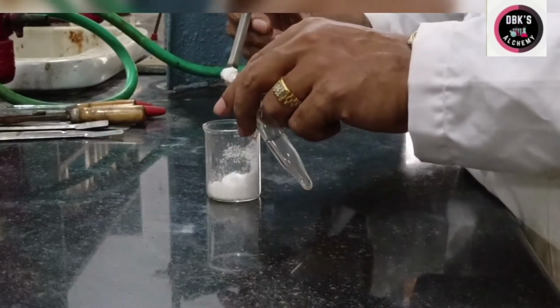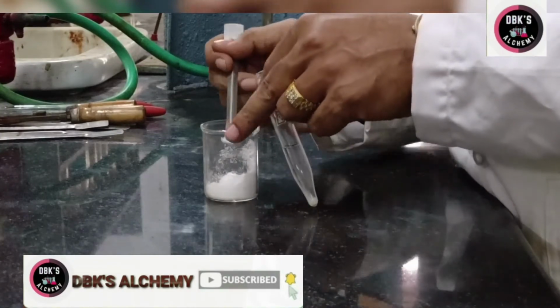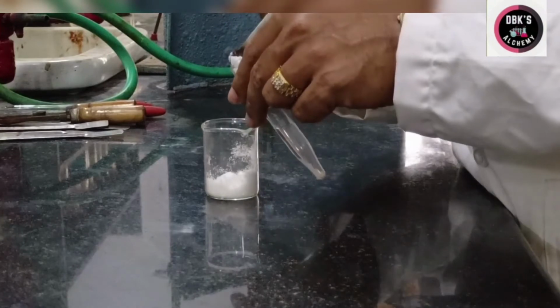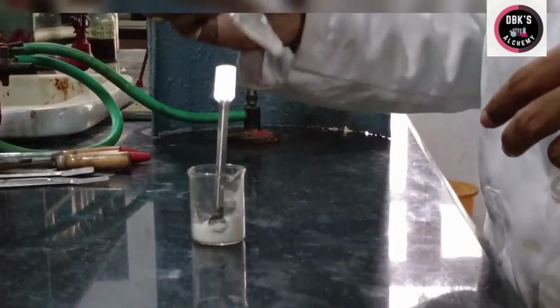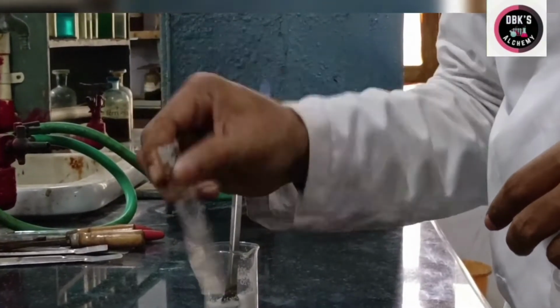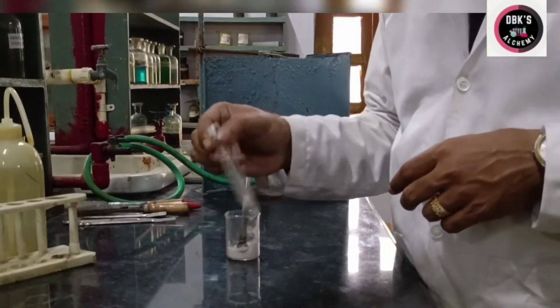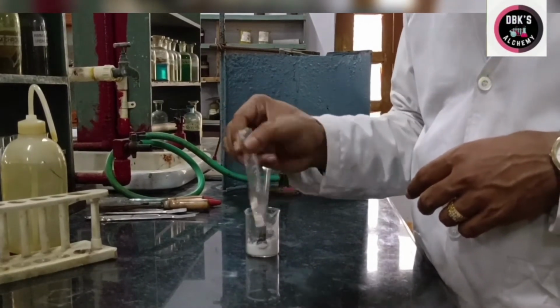I am adding ammonium chloride. I have to prepare a saturated solution. That is the reason why I am adding little excess here. Okay, so I have added ammonium chloride.